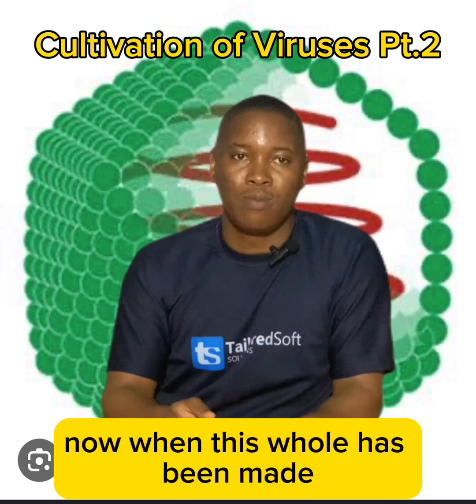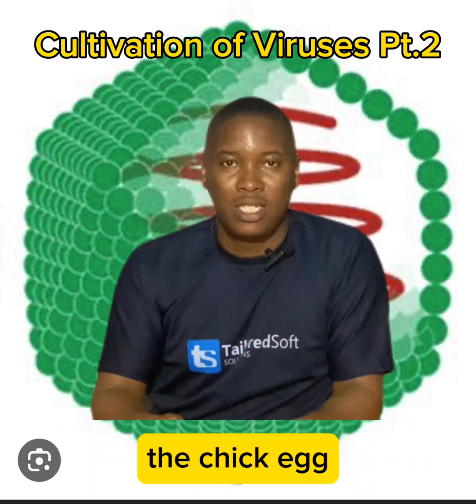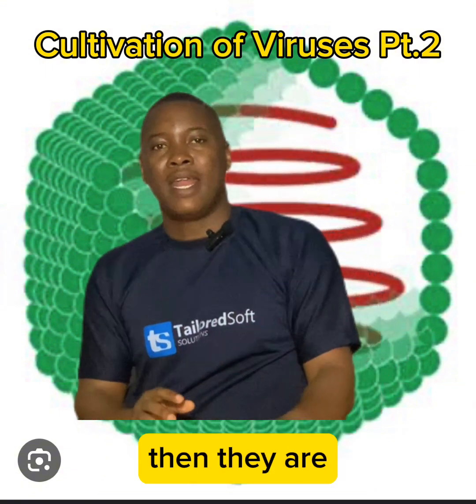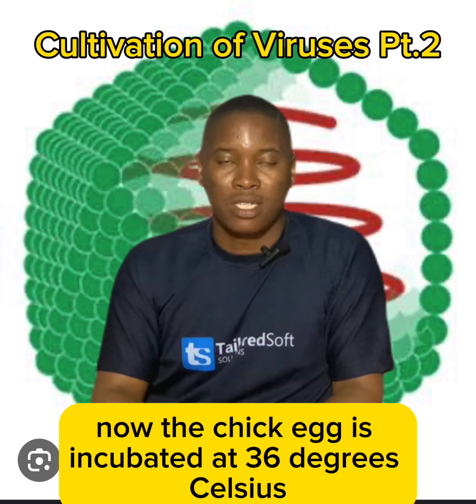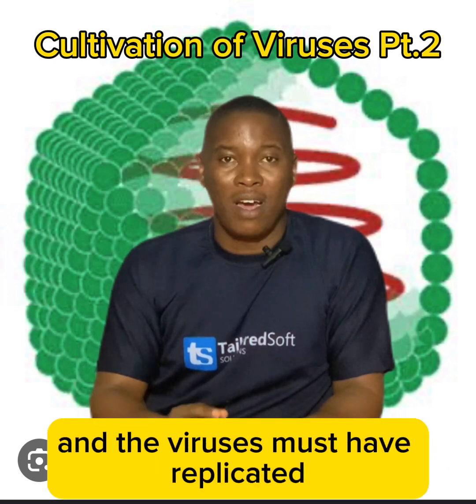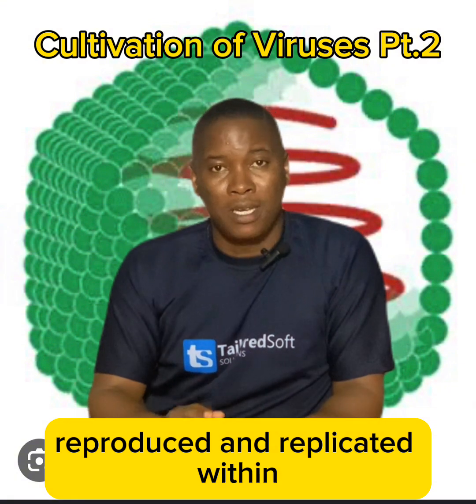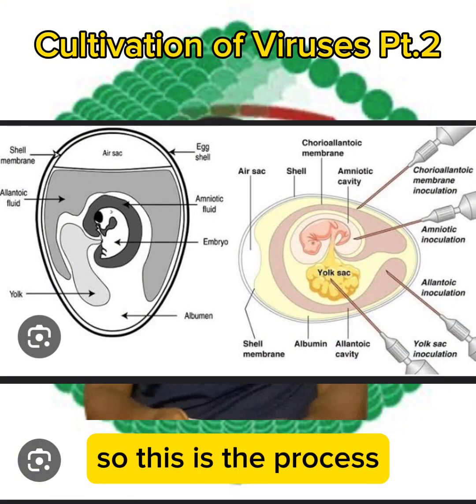Now, when this hole has been made, the viruses are inoculated into the chick egg, and then the chick egg is incubated at 36 degrees Celsius for 2 to 3 days. After 2 to 3 days, the egg is brought out and the viruses must have reproduced and replicated within the chick embryo. So this is the process.